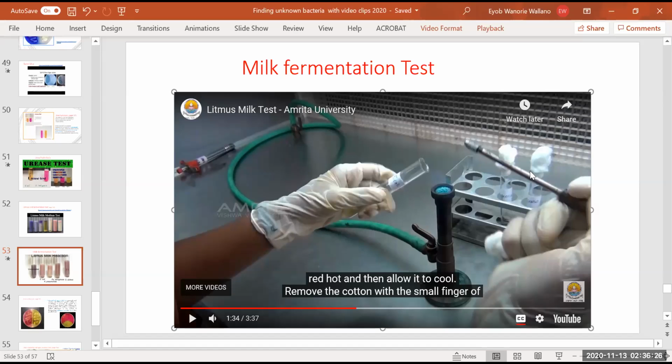Look at that, this is a loop, and by that same hand you hold the lid. The lid mustn't be left free in the other hand. So you know two things now: the lid must be held by the hand holding the loop, and you can hold the loop in the left or right hand. You need to know that.